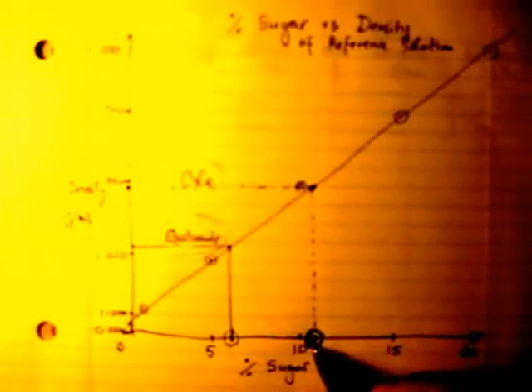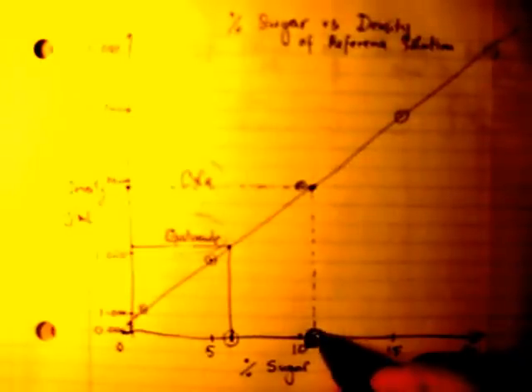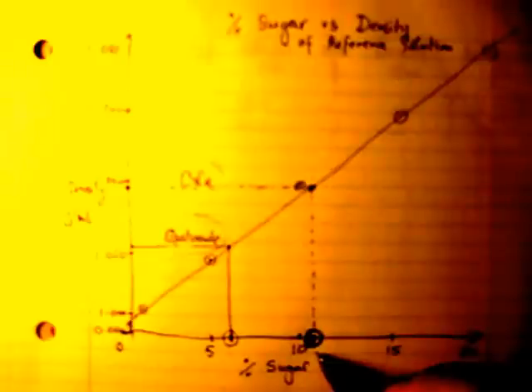So I know that you use the calibration curve to get the percent sugar content in your beverage. So that is how you determine the percent sugar content. This is your experimental sugar content, and in another video I will discuss how you calculate the accepted value from manufacturer's label information.